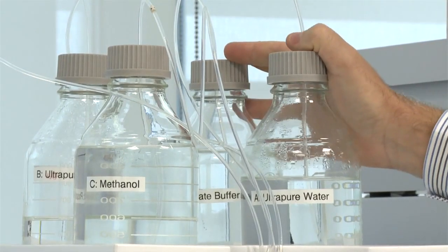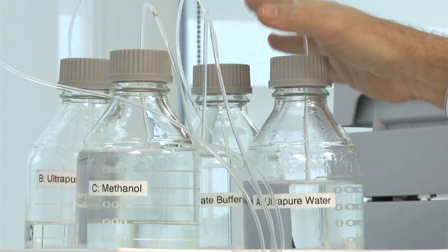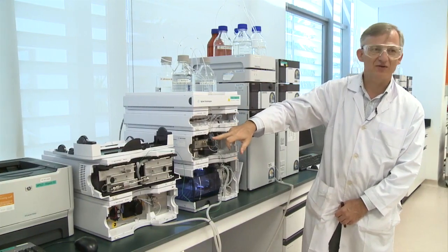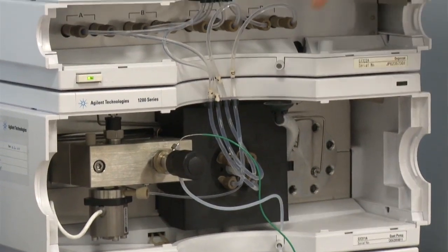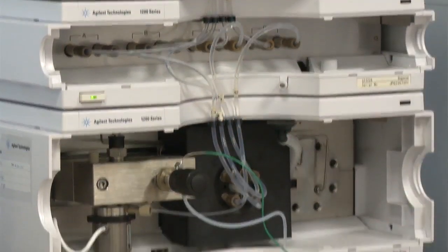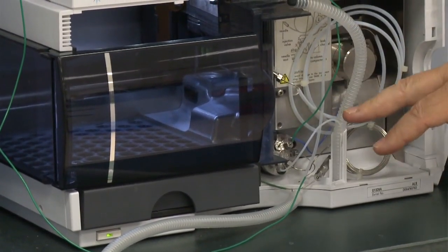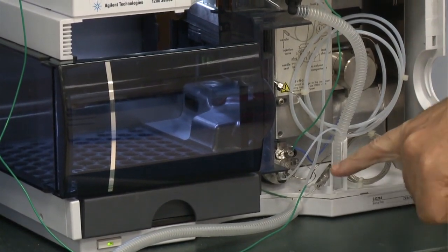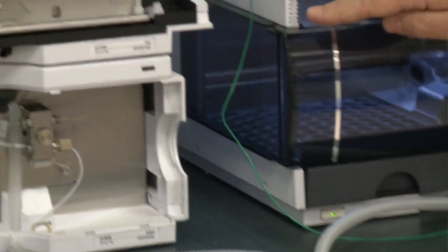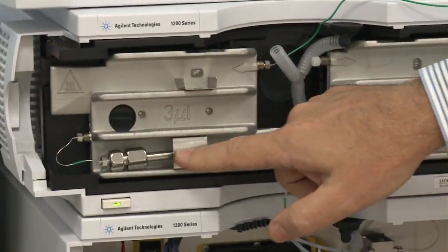Okay, this is an HPLC instrument. On the top here, we have the different components that mix together to make the mobile phase in these bottles. Here we have the pump that pumps the mobile phase through the instrument and provides the pressure. The sample is injected into the system, once again by an autosampler. It then travels along this very fine tube here to this part of the instrument, and here we have the column.